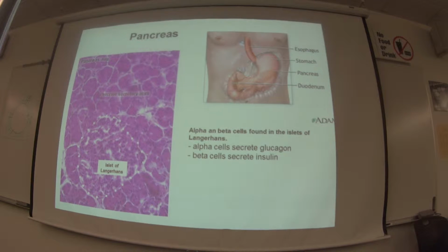And so you might be saying, well, why do I need to distinguish them? We're not looking at salivary glands this week, and you're right, we're not. But when we get to the digestive system, next, in the second half of this term, you're going to need to tell the pancreas from the submandibular, sublingual, and parotid salivary glands. And the only way you're going to do that is knowing these. So hopefully by knowing these this week, it'll make it easier in the coming weeks.